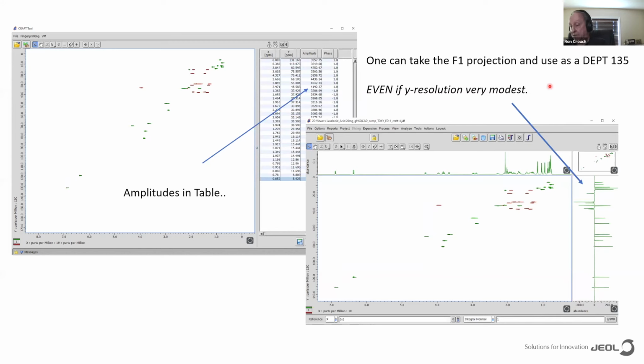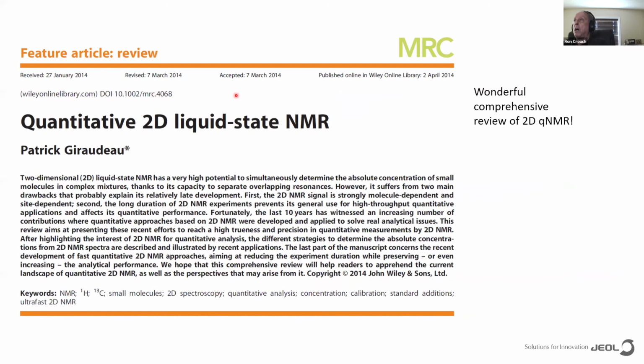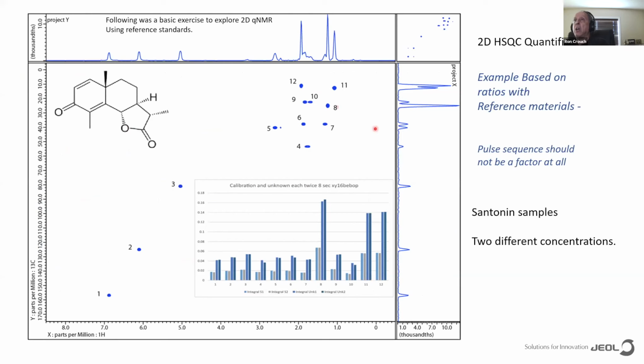So that is CRAFT. Well, 2D qNMR, does it work? Of course it works. There are some wonderful papers and reviews. This is one I read years ago. Also, Patrick, who's going to speak at an upcoming seminar, is a leader in this area, and lots of wonderful, wonderful things are to be found in these review articles.